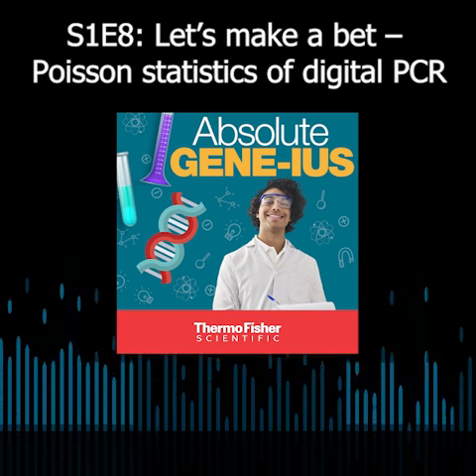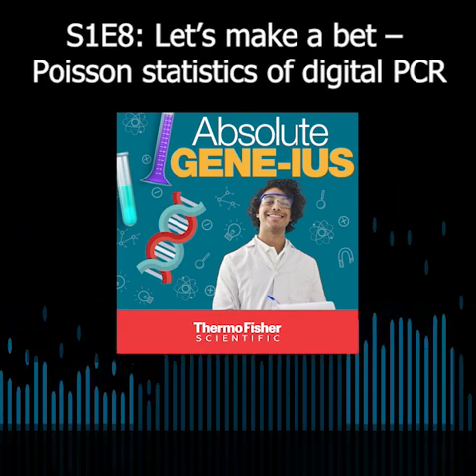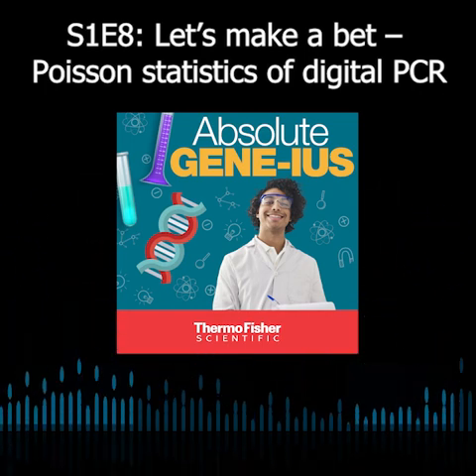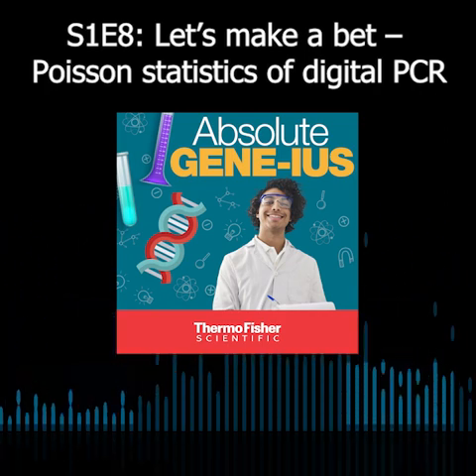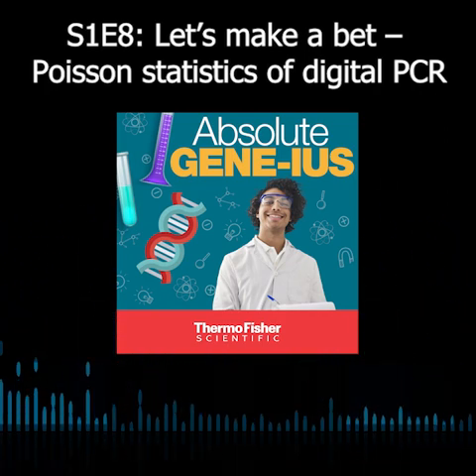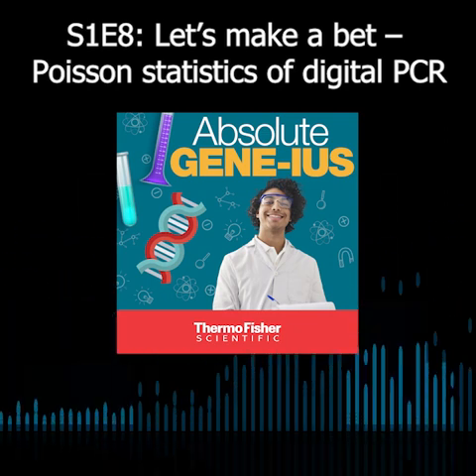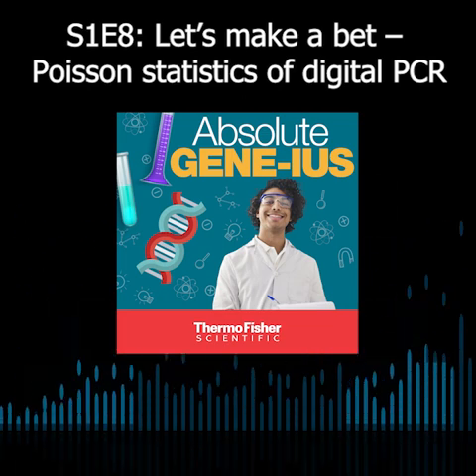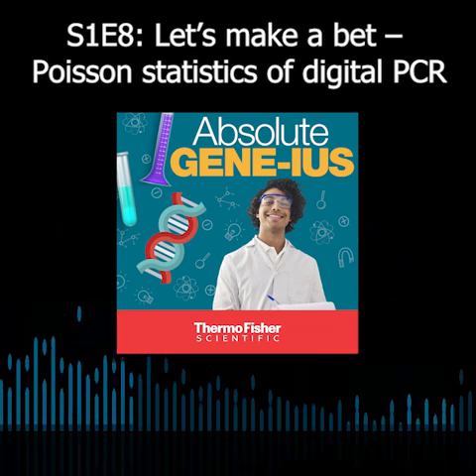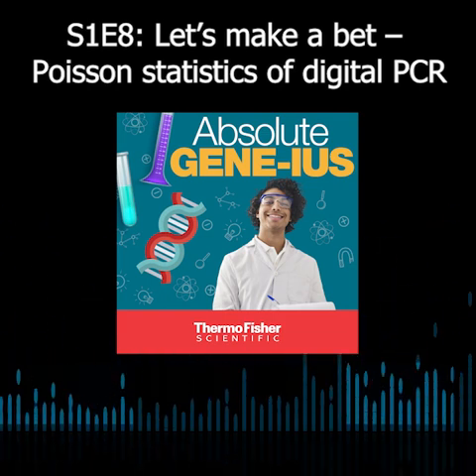And that's really where real-time PCR is a champion: you could have something at a given high concentration, get a CT value, measure it. Or you could do a billion-fold dilution of that and still get a CT value, still get some kind of measure. But with digital PCR, that dynamic range window is usually a bit smaller. We don't have as much range. We have a couple orders of magnitude that we can reliably work inside of.